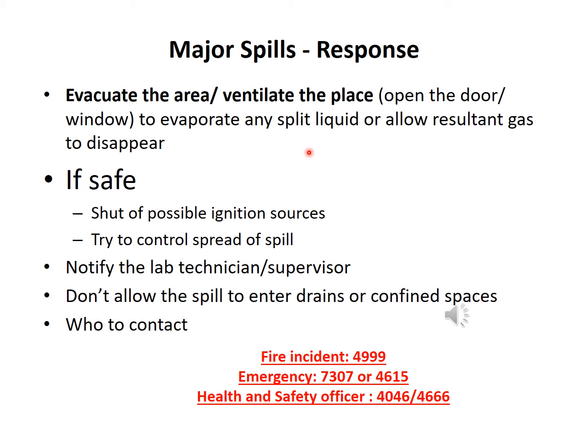To evaporate any spilled liquid, allow the resultant gas to disappear by opening the door or the windows, if it is safe. For example, although this is a major spillage, you can still do a little.